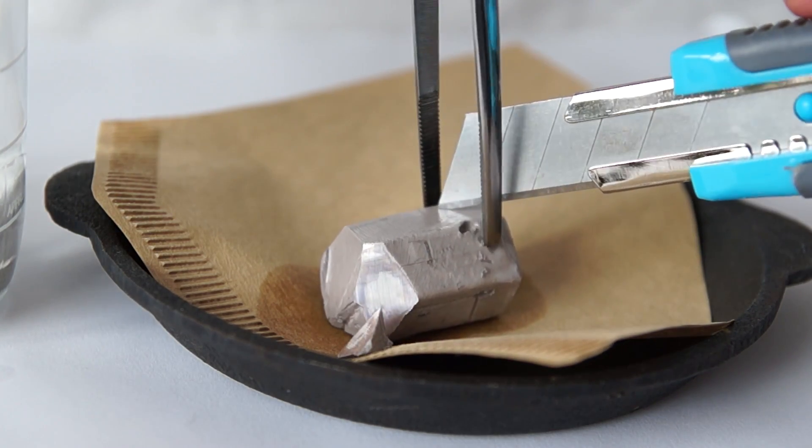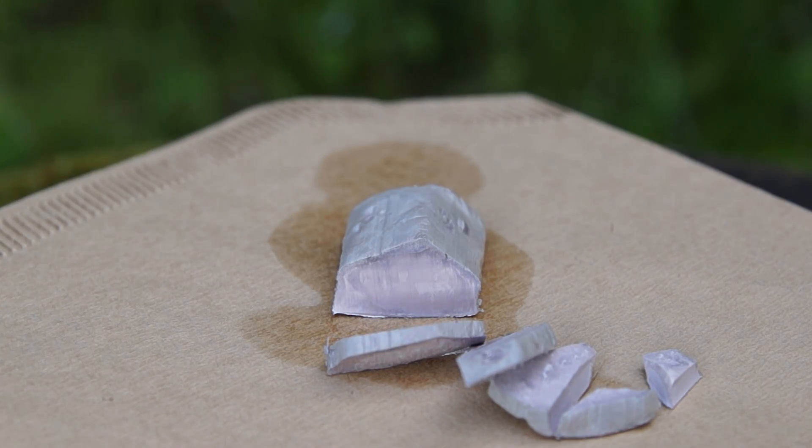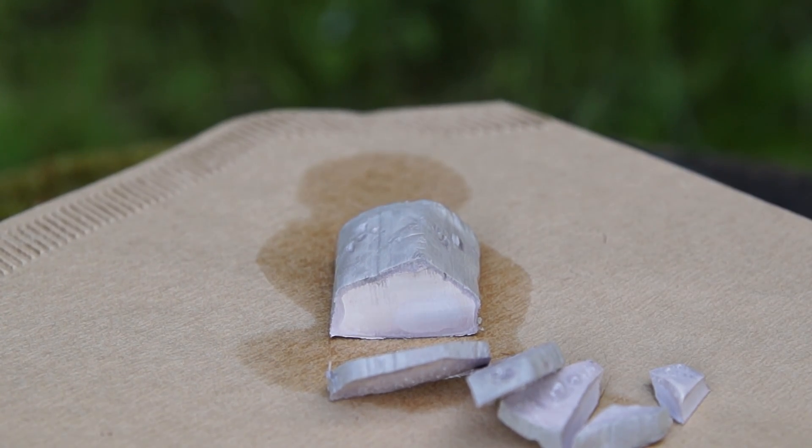It requires the same effort to cut it. On the cut edge you can see the shiny surface of sodium. However, being exposed to air, it oxidizes very quickly and becomes covered with a layer of peroxides and carbonates.